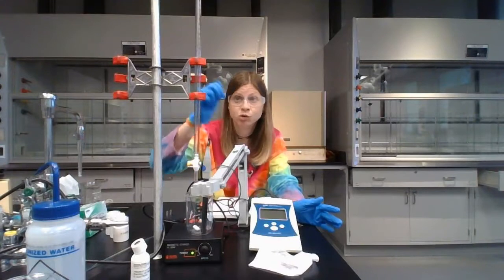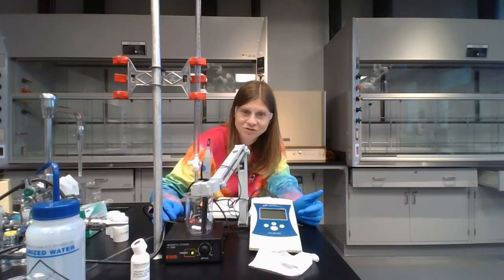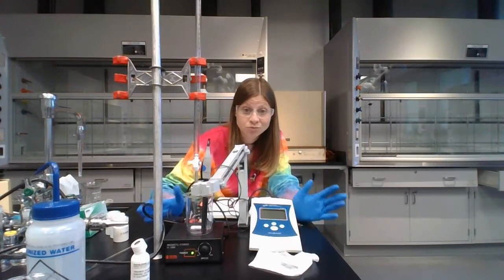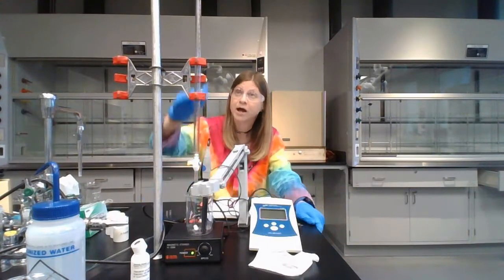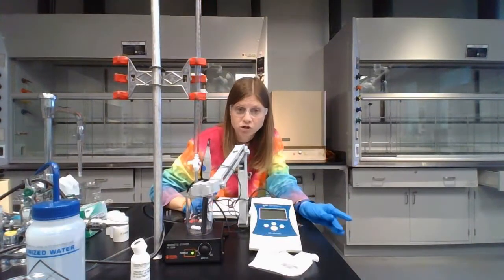Okay? So you're just going to keep doing 1 milliliter increments until that happens. Every unknown is going to be different, so I can't tell you exactly how many milliliters this will be. It's going to depend on what chemical you have, what your unknown number is, what its concentration is, all kinds of things. So that's going to be trial 1. When you're finished, you're going to take your burette and fill it back up to 0.00 with sodium hydroxide to get prepared for trial 2.